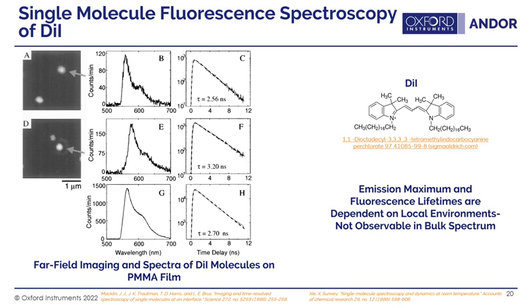Now, if we look at the fluorescence emission spectrum of both of these molecules in figures B and E, we can see that the emission maximum for each of these molecules is different. And we can also look at the time-resolved fluorescence spectrum of these molecules in figures C and F, and we'll notice, as we talked about with fluorescence lifetime in session 2, that the fluorescence lifetimes for these molecules are different.